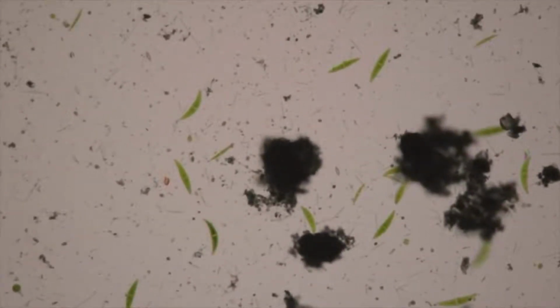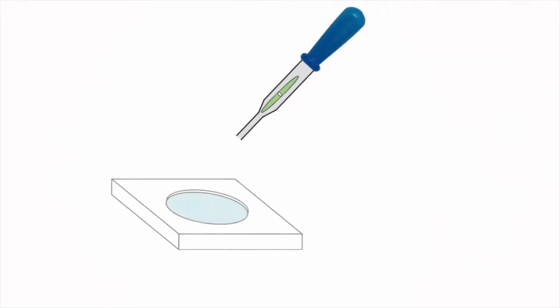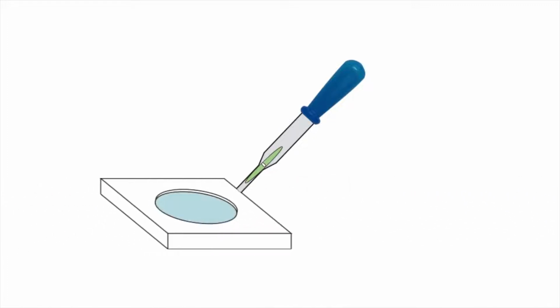The water sample contains foreign matter other than algae. Only a single cell is isolated from this sample. The cell is transferred to a clean medium and cleansed repeatedly. Isolation is conducted through this process.